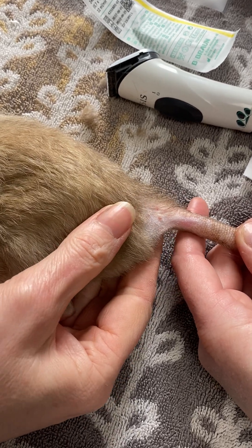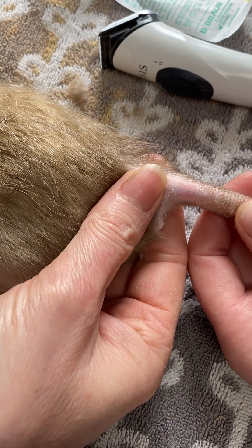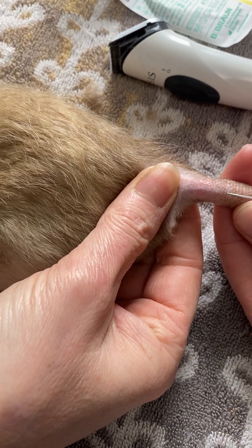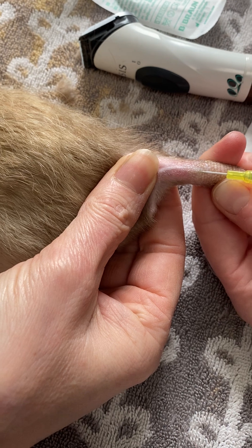Today we are going to be placing an intravenous cannula in a rat. As you can see here, the nurse raises the base of the tail — we've just clipped a very small patch — and hopefully you can see the blood vessel that's just sat there. I'm using a 24 gauge cannula and I'm just going to pop this incredibly superficially into this blood vessel until you see some flashback.